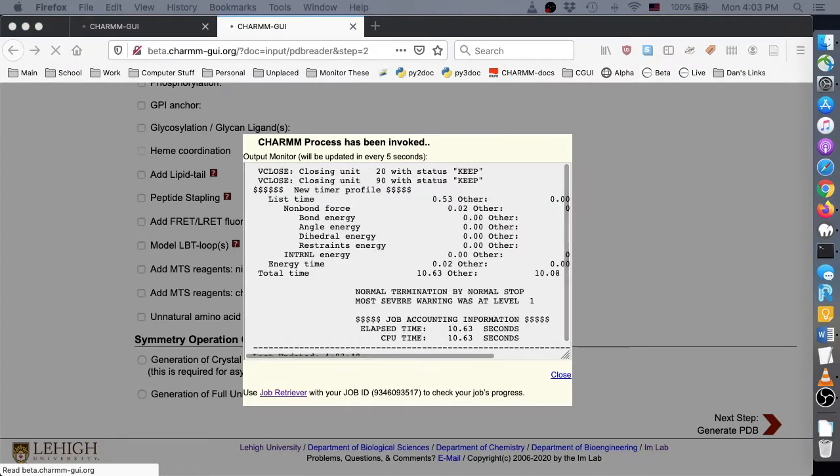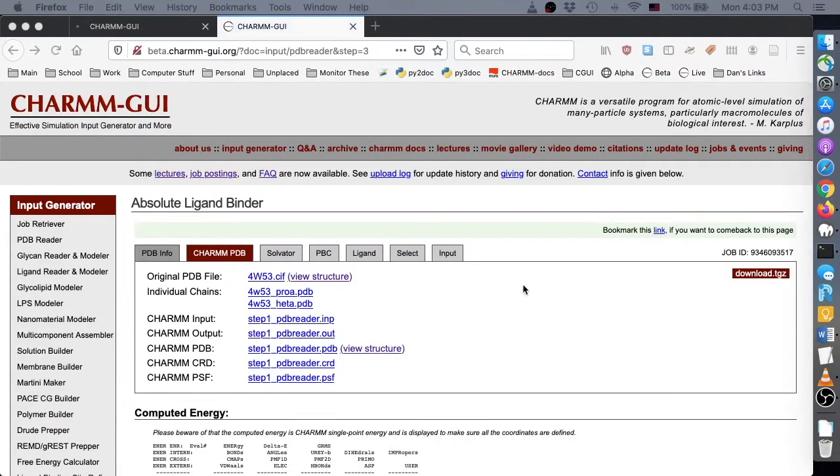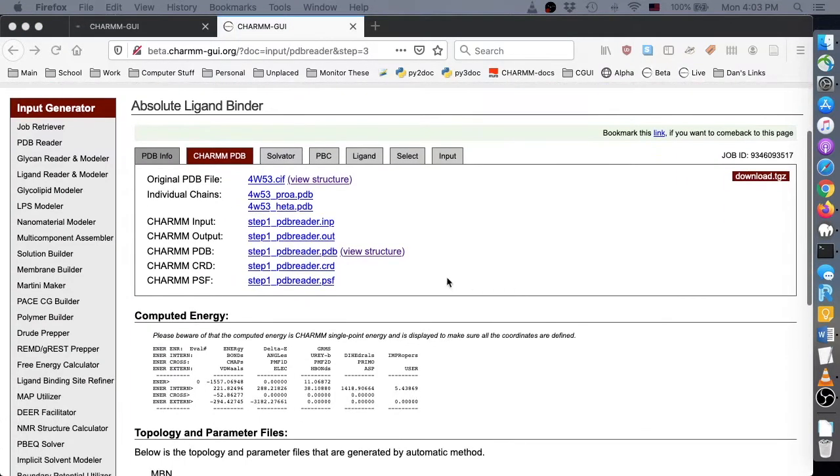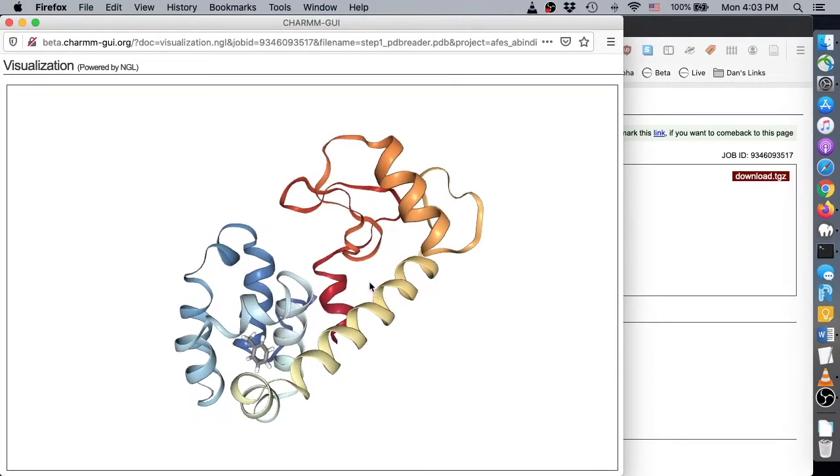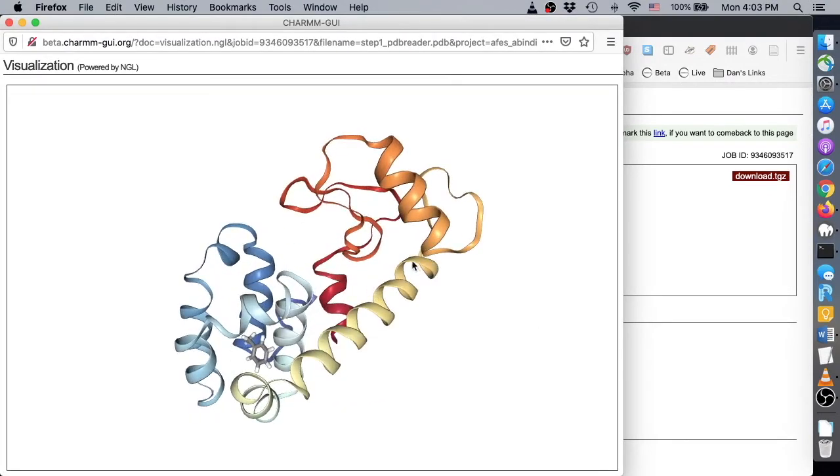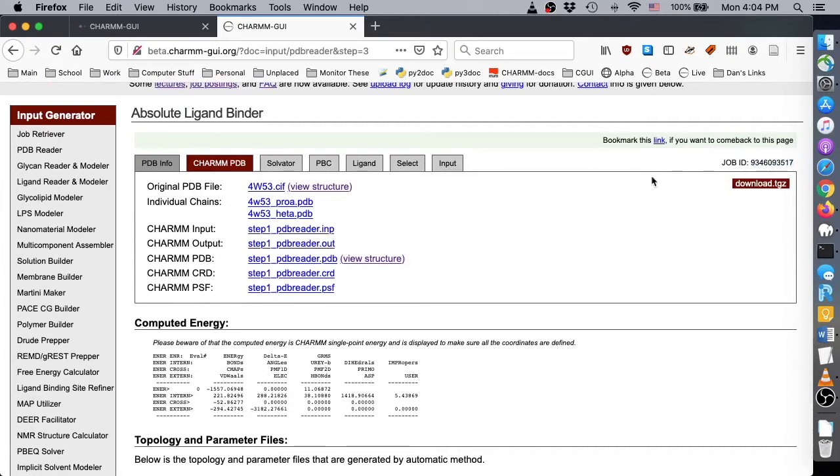We can see the result of PDB reading and manipulation on this page by clicking View Structure. Notice that the EPE residue is no longer present, but the toluene remains. In any case, it is important to save the job ID so that you can check the job progress using Job Retriever or return to a previous step to modify your options.